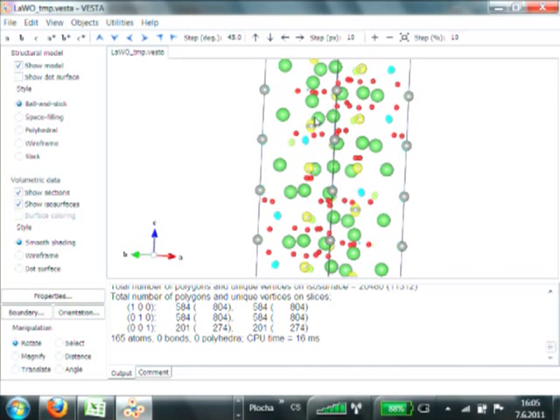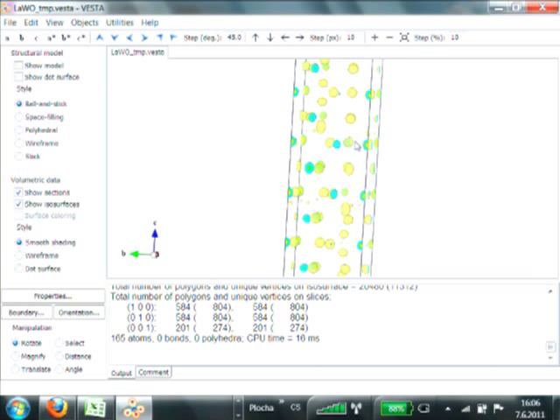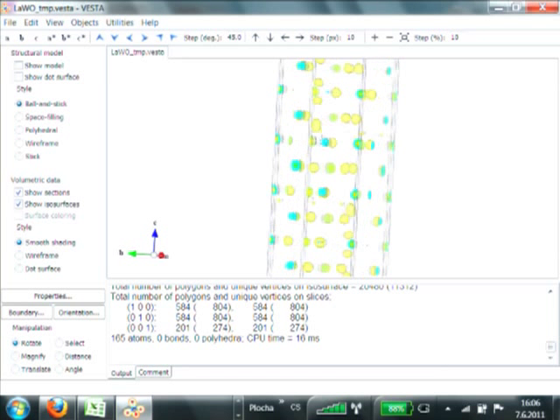It's difficult to say just like that that the structure is correctly solved, but you can see that it's quite uniformly populated with the heavy atoms. If I switch the model off, it's actually a clear picture of a solved structure.